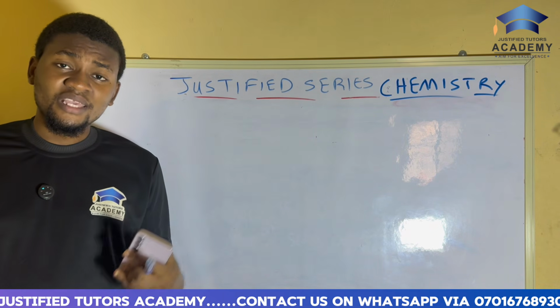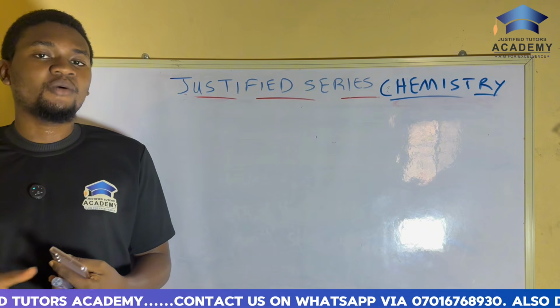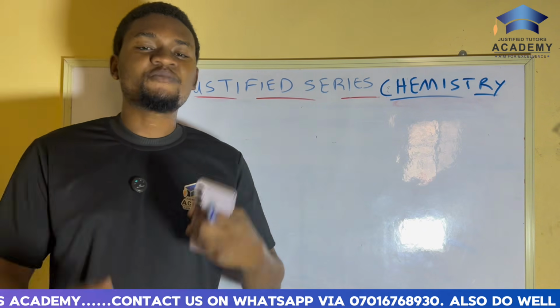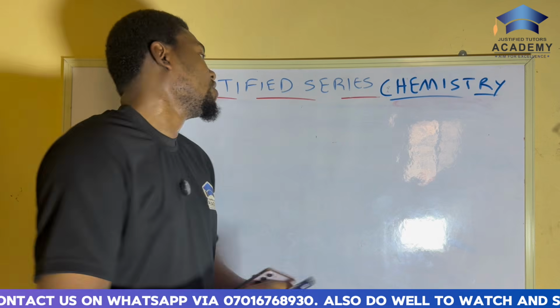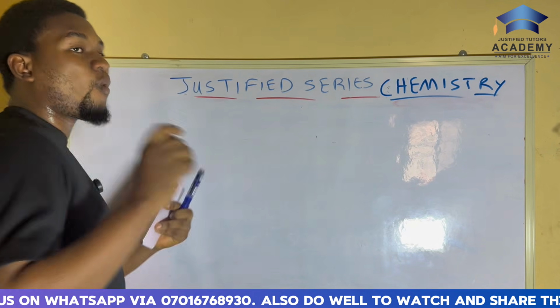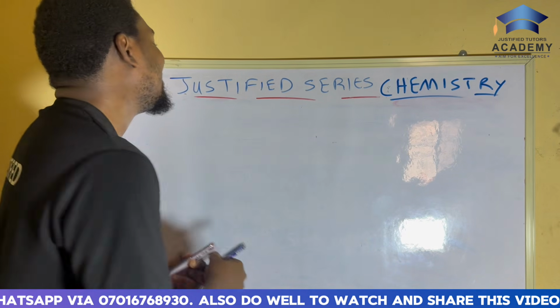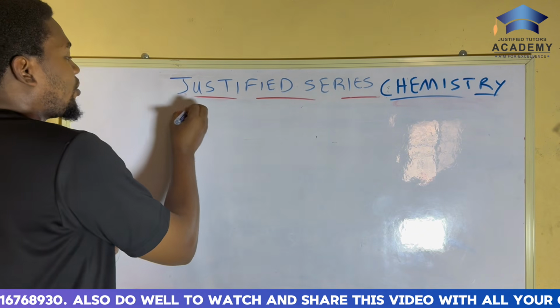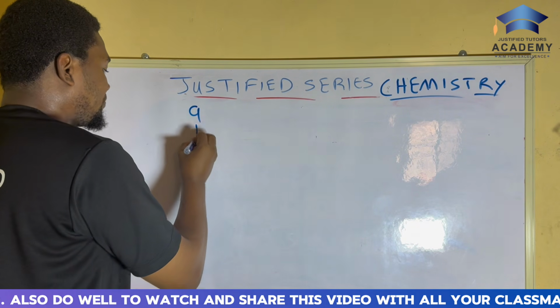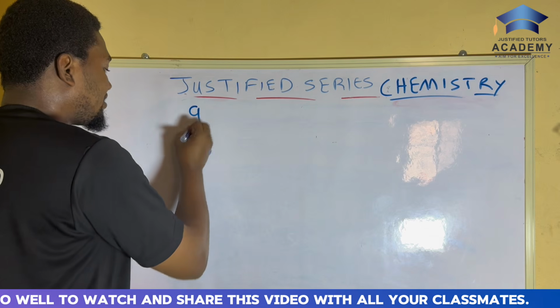So today we are taking chemistry practical. Before I start with the questions, I just want to explain to you how chemistry practical is. WAEC Chemistry Practical is divided into three parts. We have part A, part B, and part C.